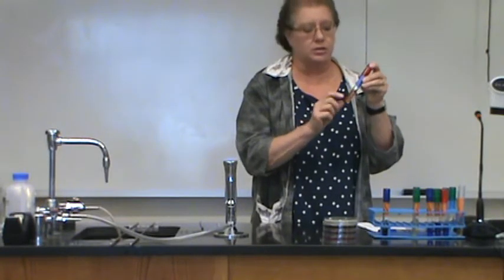Okay, so then we go on to the urease test. And for the urease test, you're using a urea broth. Okay, it's kind of a little orangey color. So urea broth. If a bacteria can degrade urea, then it produces the enzyme urease. Okay, so the way you'll be able to determine that is to inoculate a urea broth.